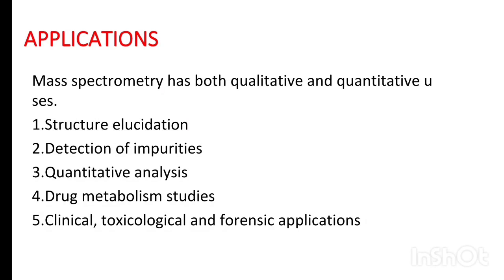Applications of mass spectrometry. Mass spectrometry has both qualitative and quantitative uses. Structure elucidation, detection of impurities, quantitative analysis, drug metabolism studies, and clinical, toxicological and forensic applications are some applications of mass spectrometry.